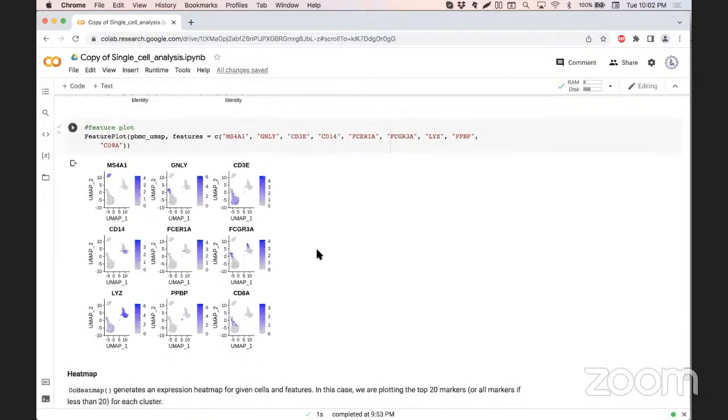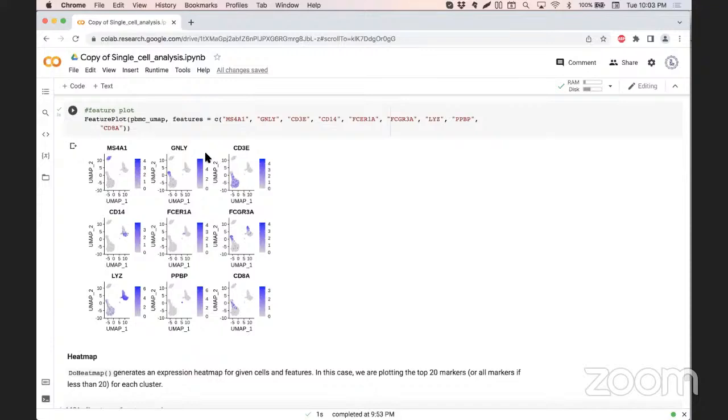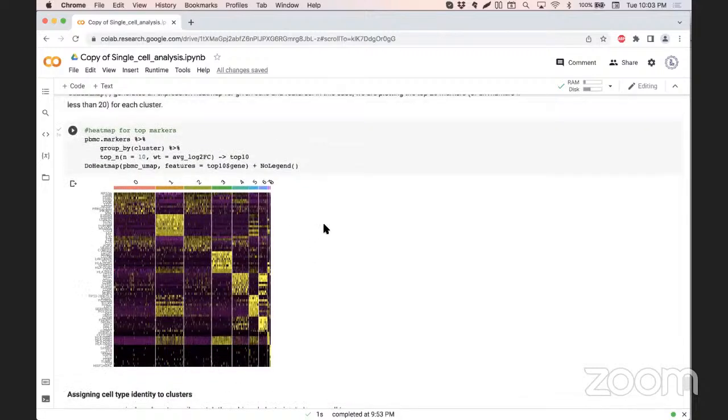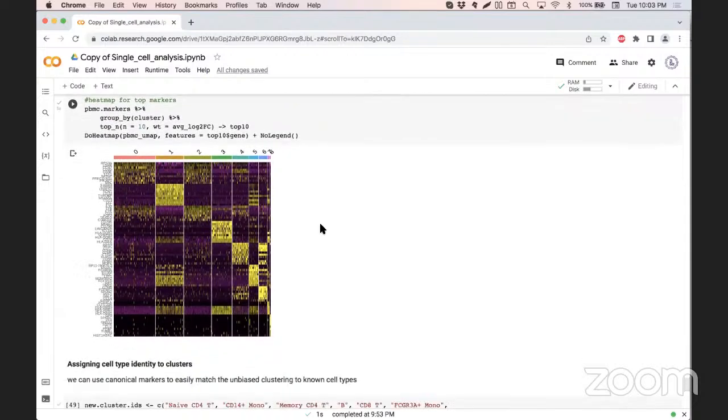And then this is one of the most interesting feature plots that we will be used to employ to identify or characterize these features or these clusters and their ability to annotate or to identify different clusters. So a feature plot will do this, and then we can use the heat map visualization method simply to see how different features are actually contributing to visualizing the difference in the expression pattern that is observed by different clusters.